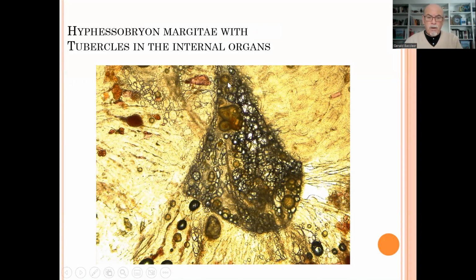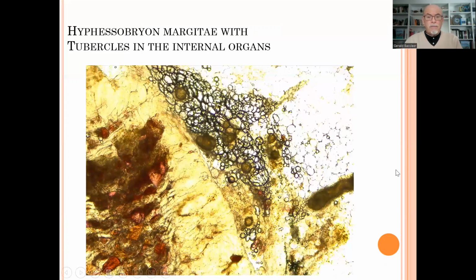Here you see those encapsulated bacterial colonies. The fish organs react by encapsulating, defending themselves against the bacterial invasion by making capsules or tubercles. But at the same time, healthy tissue is gone. Here you see it again. Look at that, all those tubercles here.